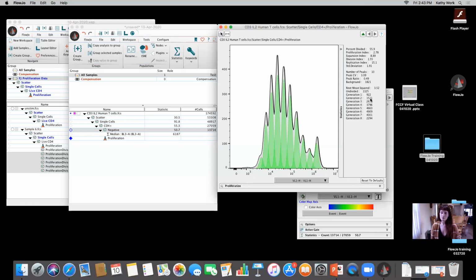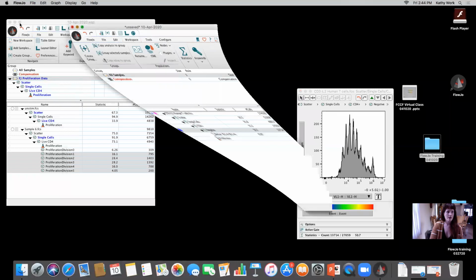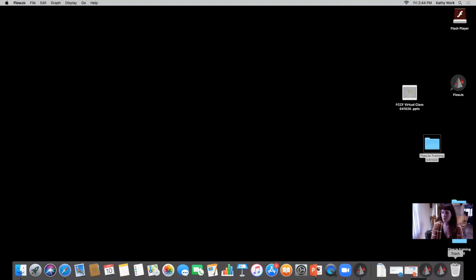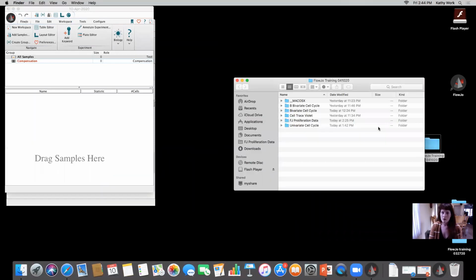The other question is if BrdU PI cell cycle analysis is always better and more accurate than PI only cell cycle analysis. So what I can do for that, that's a great question. I actually wanted to show that last data set. So for anyone that's sticking around, I think we still have a couple of people. What I can do is I can show you that data set, and I'm going to go through it very quickly to not waste people's time.